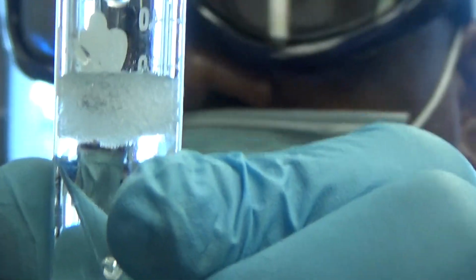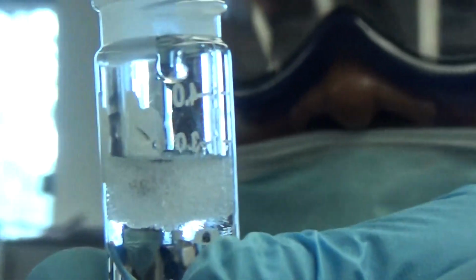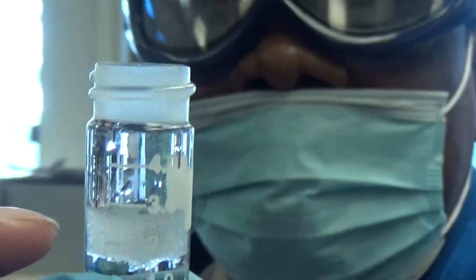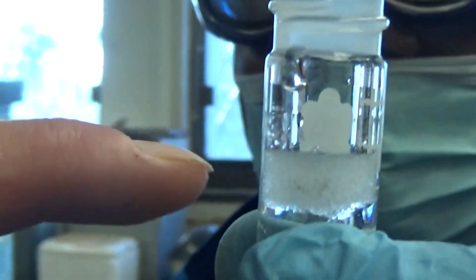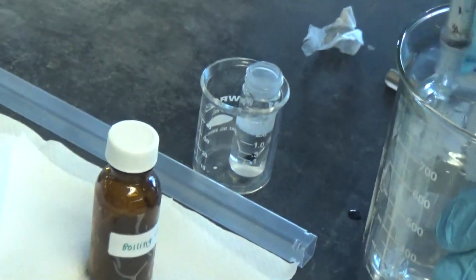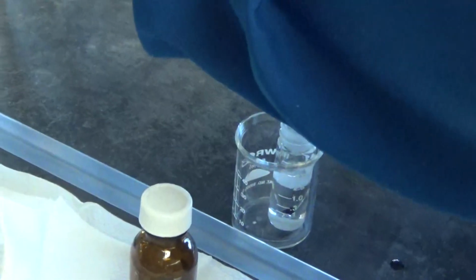You added it already? Let's see it. Okay, is it dissolved? It looked like it. There's a little bit of a white thing. That's some of the pinacol, right? Yeah. And then the acid's kind of on the bottom? Yeah. Okay, cool. So I put that back in the beaker and close that. It's very important. Put that on the side. Now I'm going to put that at the bottom.